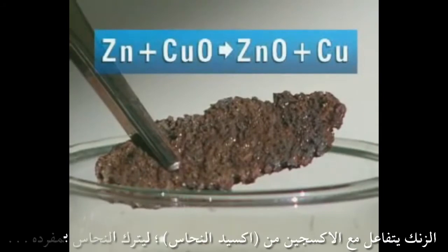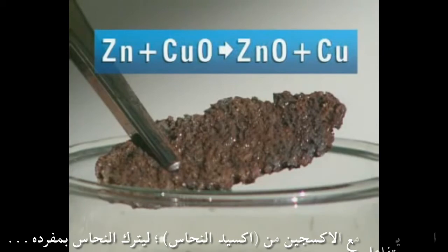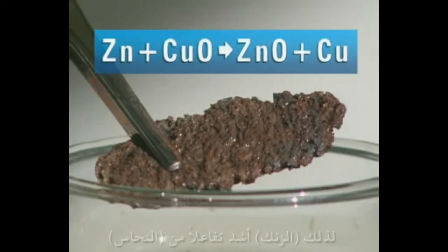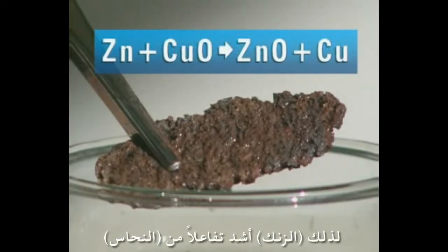Zinc has reacted with the oxygen in the copper oxide, leaving copper behind. So zinc is more reactive than copper.